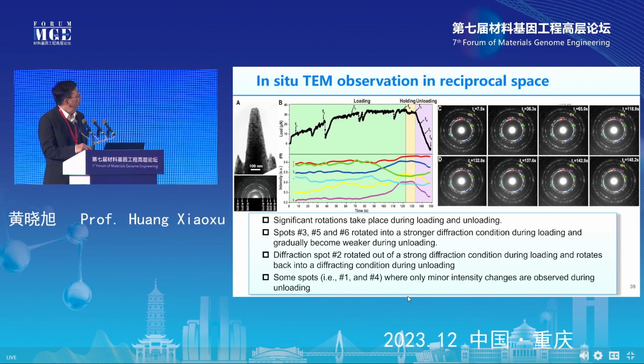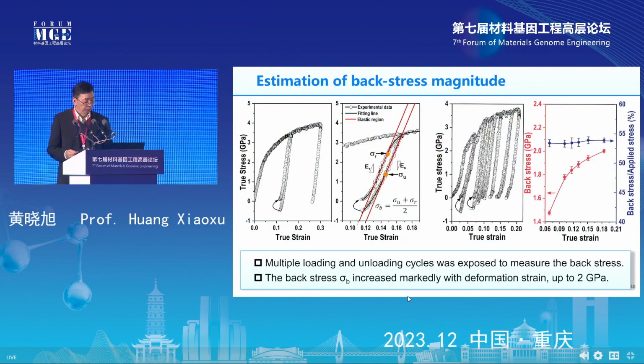But during this unloading process, you see this one, the purple one, this gold one, this blue one, they all decrease their intensity. Anyway, we do see the intensity change during this unloading process. After removing the load, the stress, the crystal can still rotate.